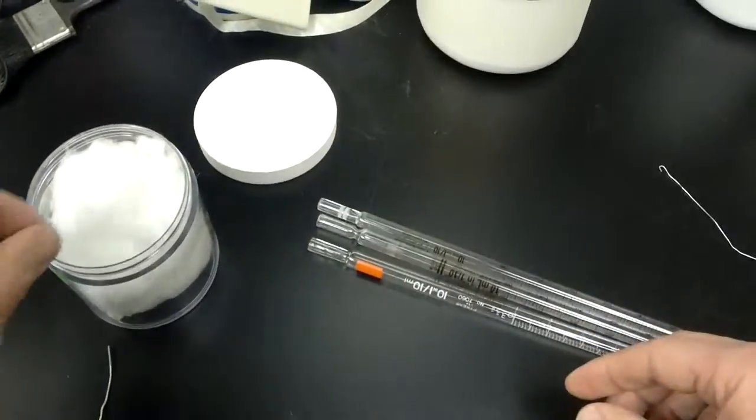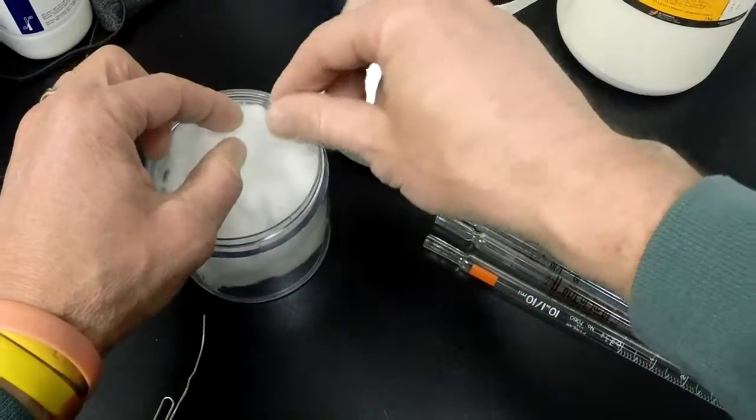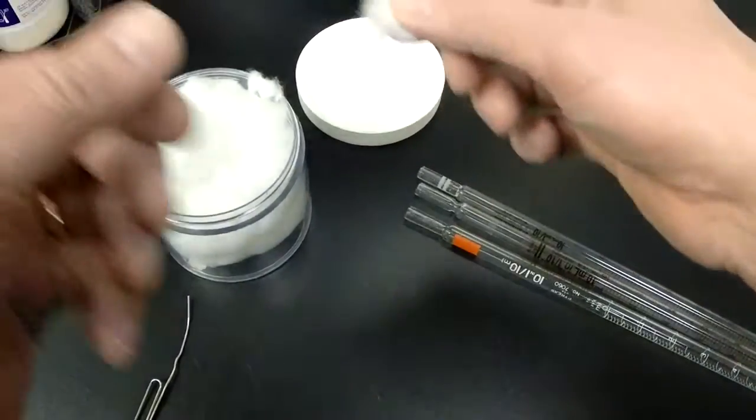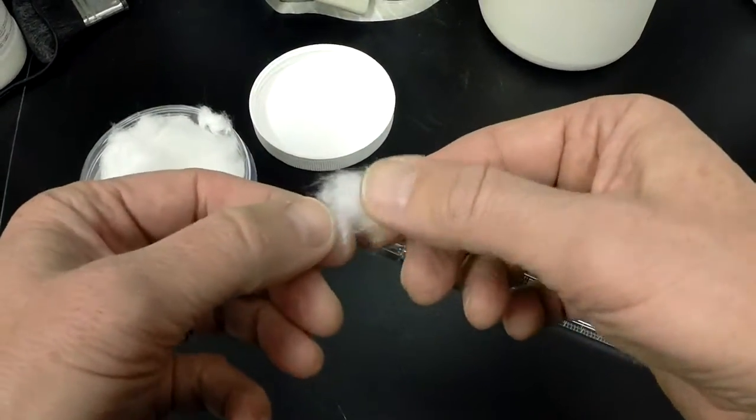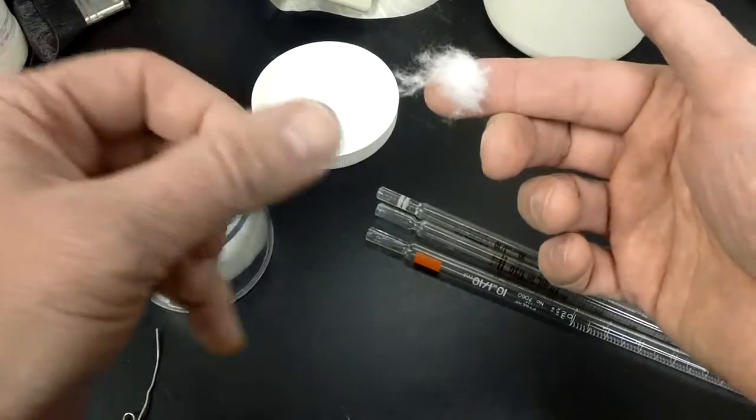The way to think of that is the cotton is being used to absorb it, kind of like in the top of your medicine bottles. You need to take the right amount, which is about this much—about the size of the end of your finger.